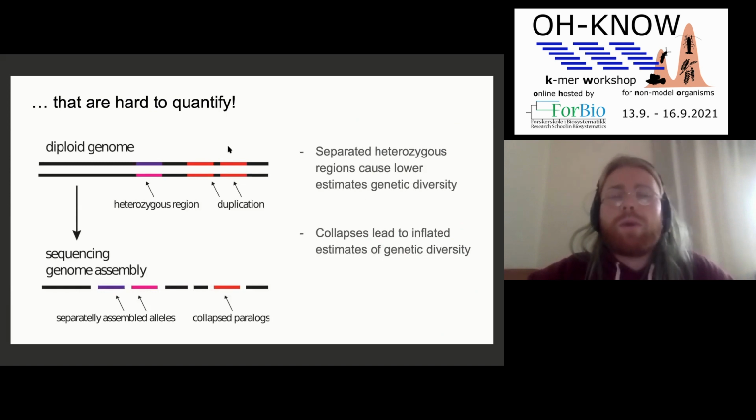So what I mean by collapsed paralog is that when we assemble a genome, we would like to have a single haploid reference. We would like to have it from telomere to telomere, but only one of them. And then we would like to map reads back and see that in this region they're heterozygous, and then we have these two paralogs that are in the reference separated, right? So when I mean collapsed, it means that if I assemble it as a single scaffold, not as two different scaffolds with a few differences. So that's what I mean, a collapsed paralog.